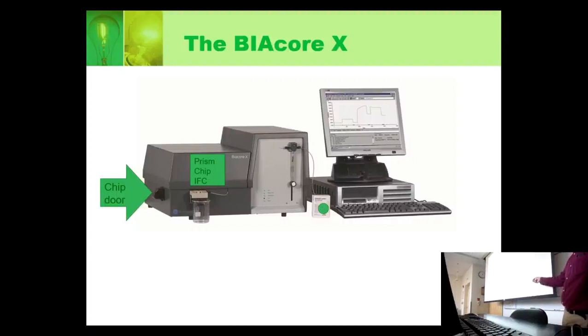So you have buffer at an inlet, and actually the pump is just a syringe. It's very simple, but it's effective and it works. And the outlet is over here. The injection port is also right there. So you remember how all of you, except Deanna and Deb, of course, because you're in a different class, have all injected samples onto the FPLC already. Actually, it's different but similar. You're going to be pipetting a sample into a small tube, and it's a good thing to learn, to have that sort of feel for how it is to use an instrument like this.